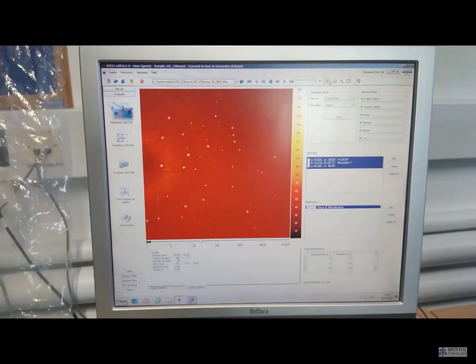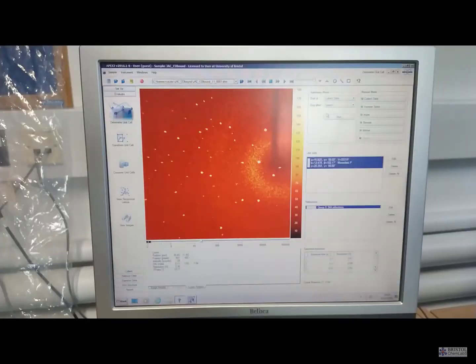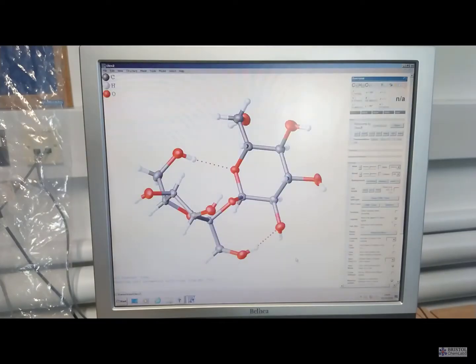So here is an example of some of the diffraction patterns that we get from our measurements. The size, the intensity and the position of these spots give us information about the structure. This would be the point with a normal microscope where we use lenses to refocus the image so that we can see and understand that by eye. However, we don't have lenses that work with X-rays, so we use some mathematical calculations that enable us to initially turn this information into an electron density map, and from there we can eventually get through to our structure.